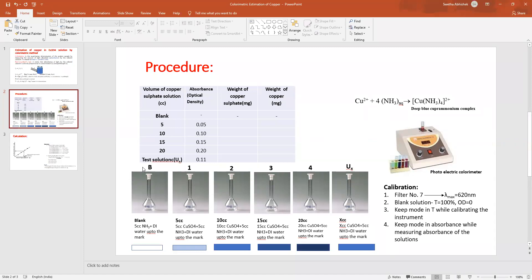For the preparation of standard copper sulfate solutions, you will be given six standard flasks of 100 mL volume. These flasks are labeled as B and U, and numbered 1, 2, 3, 4. B stands for blank solution, U stands for unknown solution, and 1, 2, 3, 4 are flasks in which you will take a known volume of copper sulfate solution.